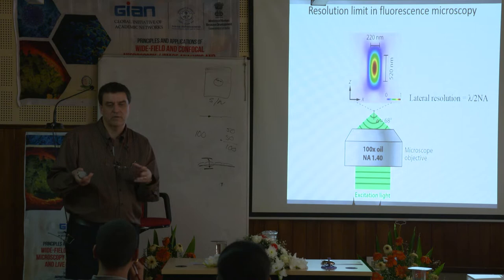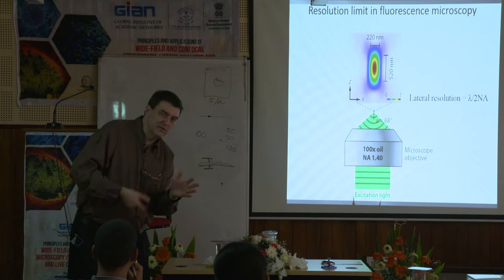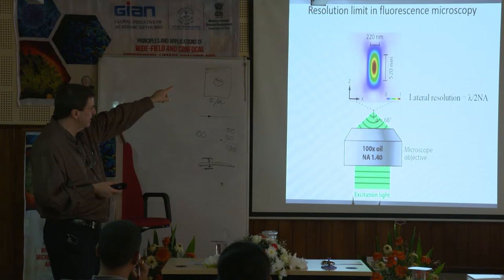It's right around, I think, 26, 27, 28,000 genes, 29,000 genes, something like that I've read. My guess is it'll change again. But things always change in science. And this was a very interesting problem for a lot of years. Like, wow, it'd be nice if we could do better than this, but the physics says, nah, we can't do any better than this, okay?